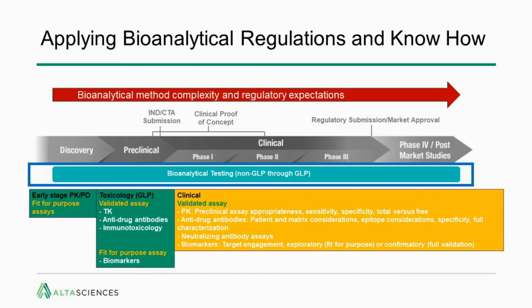So if we start off with the validated PK assay, this is certainly a requirement and has to be carefully considered with regard to, can one transition the method that already exists preclinically and simply adapt it for clinical use, or do you have to adapt a brand new method? There are certain considerations such as sensitivity, specificity, and measuring total versus free drug that are also relevant to consider.